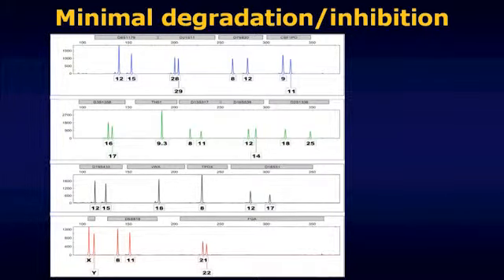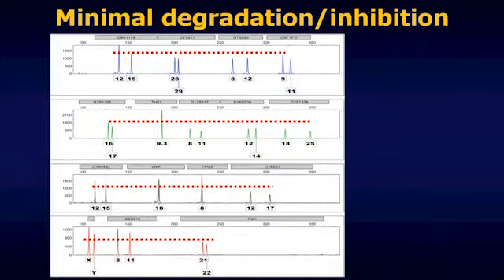At a locus where the peaks are for a heterozygote, where we see two peaks, the peaks within the locus are about the same height, and similar to the other heterozygous peaks that you see in that same electropherogram. And so we could just draw a straight line, parallel to the baseline here, that pretty well characterizes the heights of these peaks.